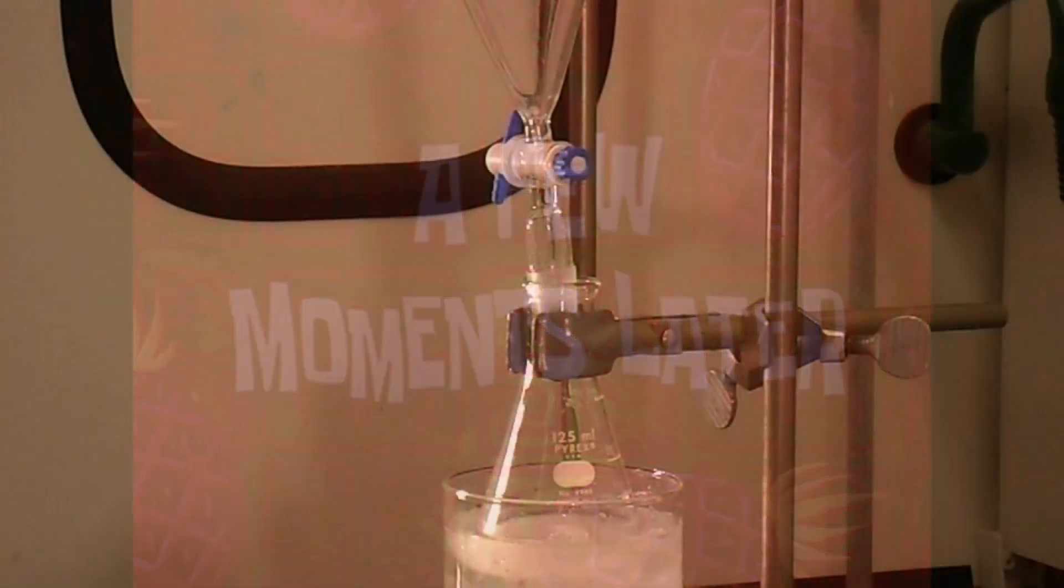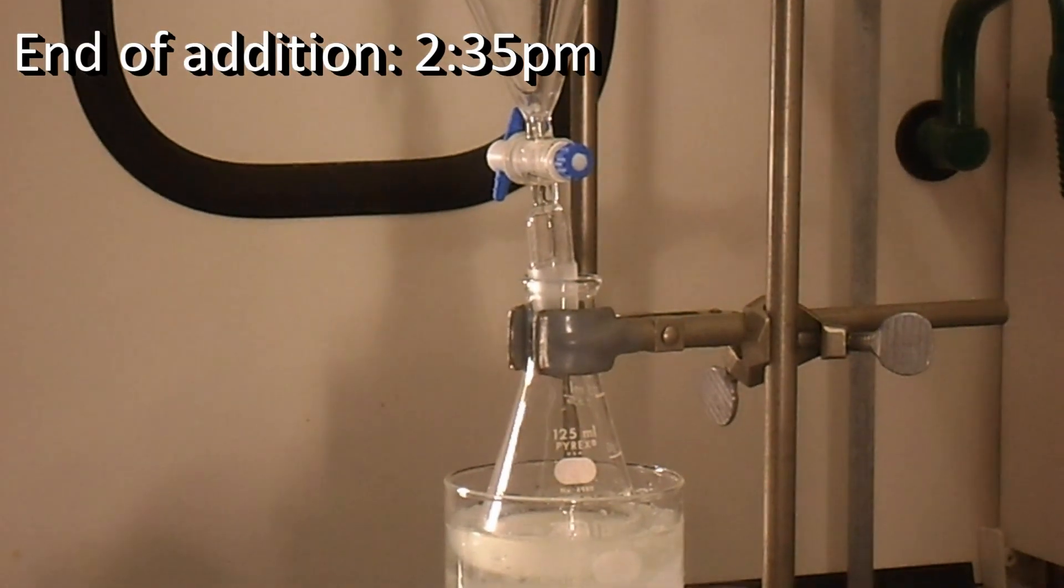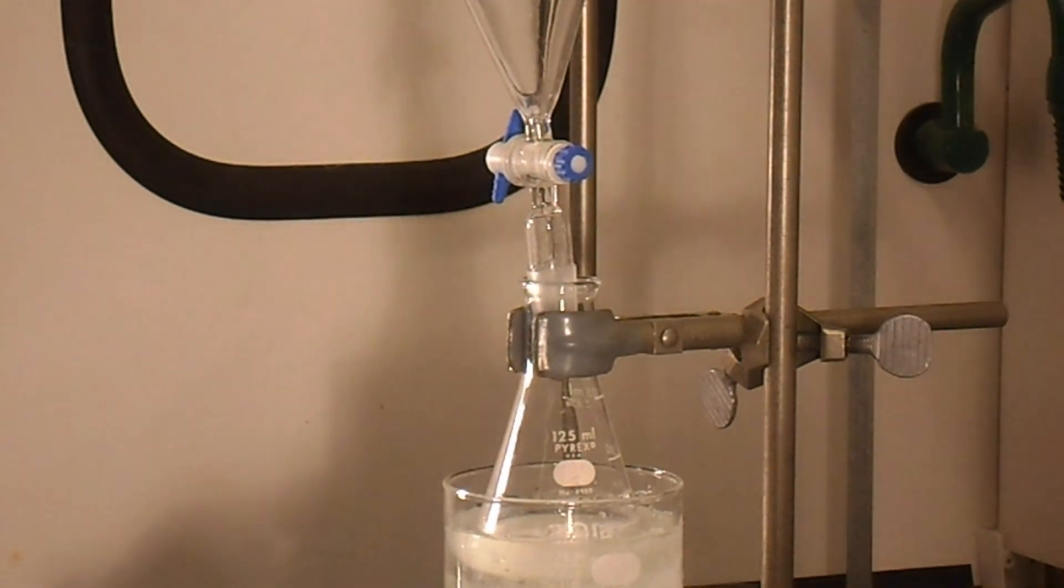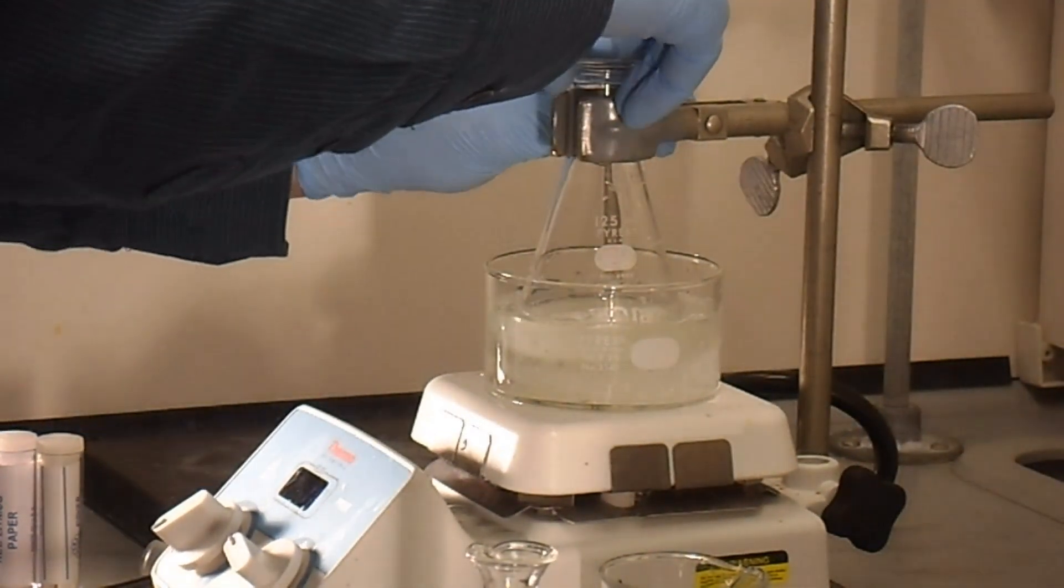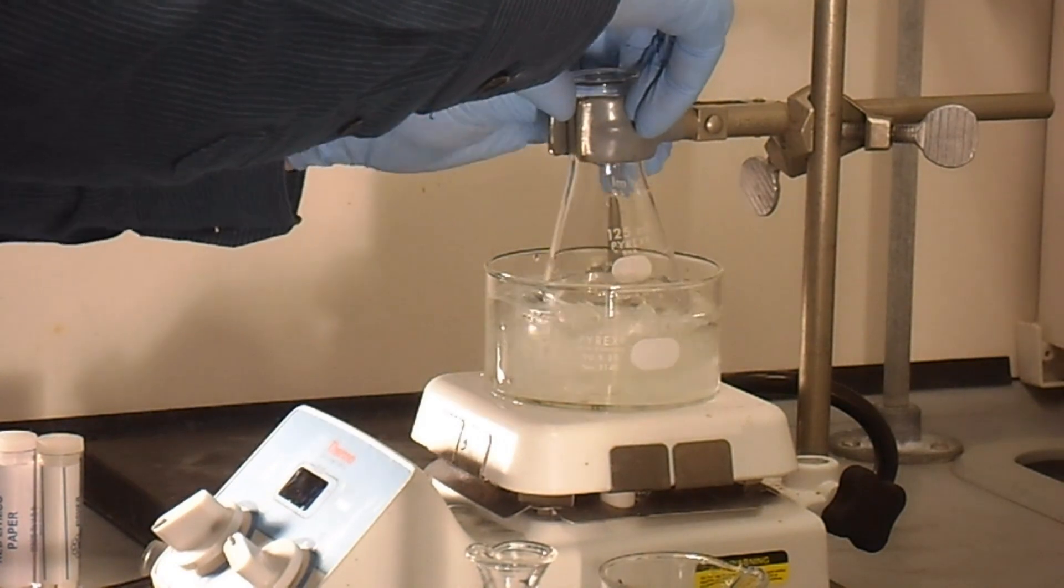So it's actually been about five minutes. As you can see, there is no more bleach in our separatory funnel. So now we will remove the Erlenmeyer flask from the ice bath. And as you can see here, once the water bath has been removed, the solution has become very cloudy and white.